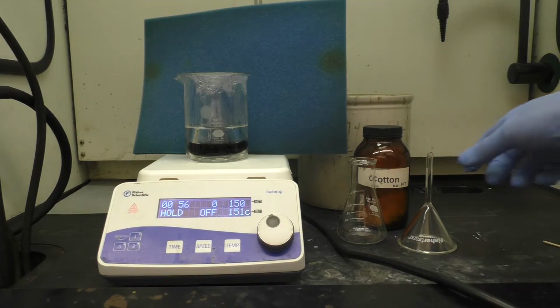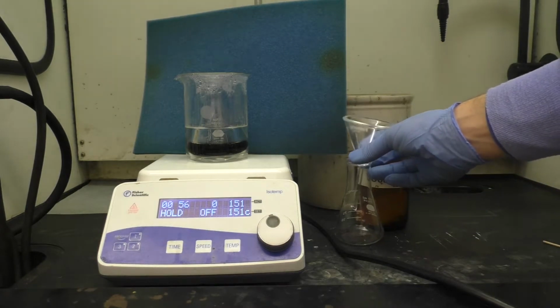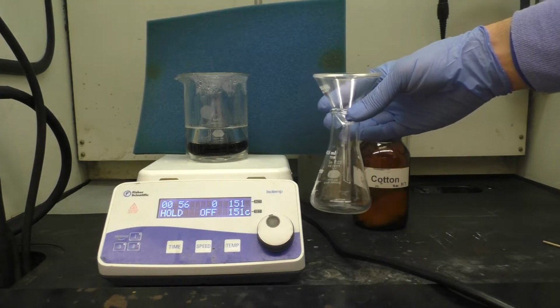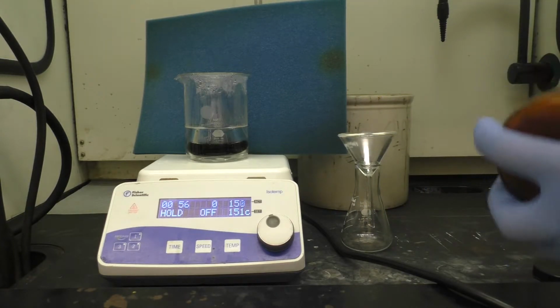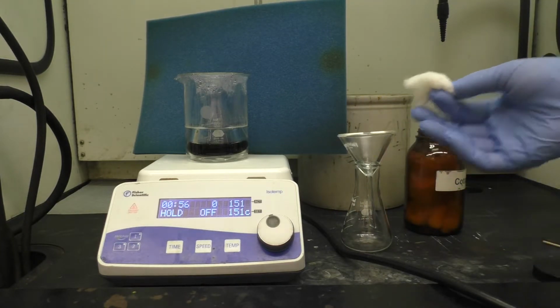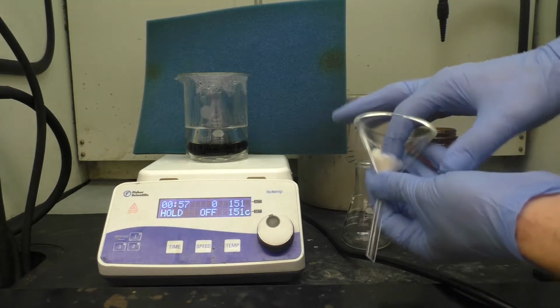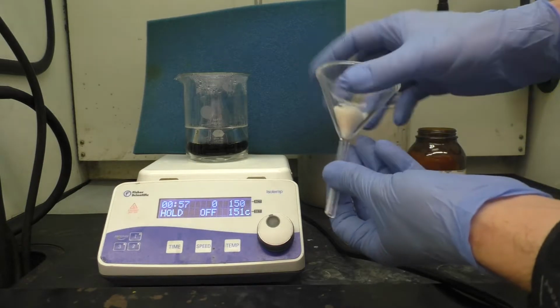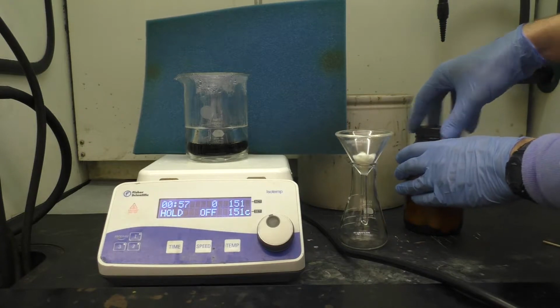To do this filtration, we'll take a funnel and place this on top of another Erlenmeyer flask that we can filter into. I'm going to take some cotton, a nice wad of cotton here, and just stuff that down into the filter. I just want to have a good material here that will catch that activated charcoal.